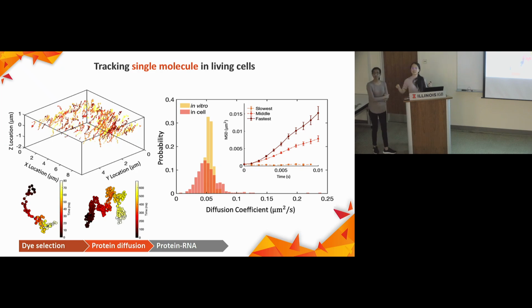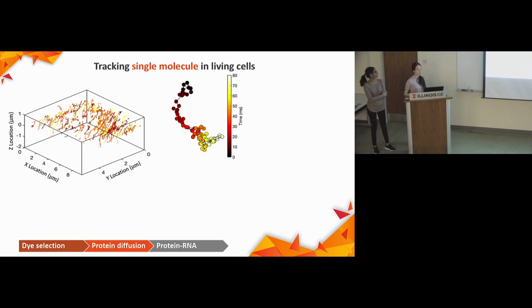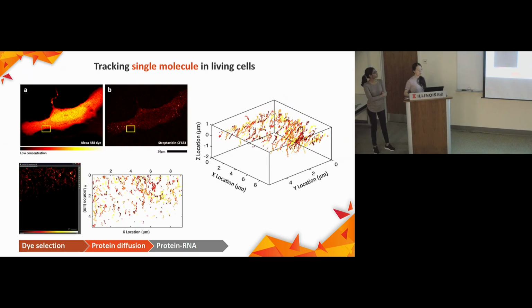You can only measure one particle at a time, correct? Yeah. We're checking more, multiple at a time. You can see those traces are not being captured one after the other. For multiple molecules, they got trapped at the same time, tracked at the same time, and then move on to the other side.